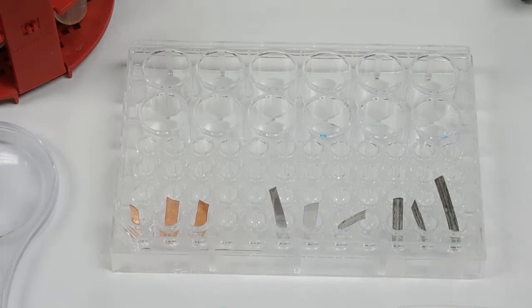One with putting zinc into 3 different solutions, and another magnesium into 3 different solutions. And so once I've made my observations on the copper, I can then go to the zinc and the magnesium and see how they've done in terms of reacting or not.